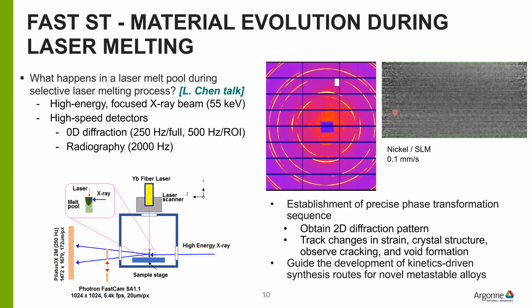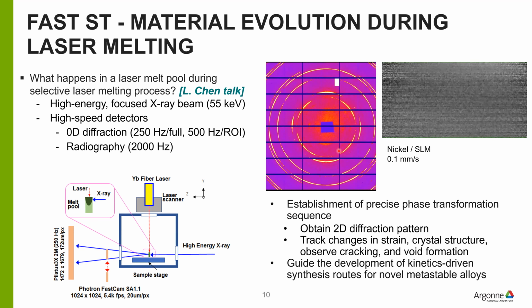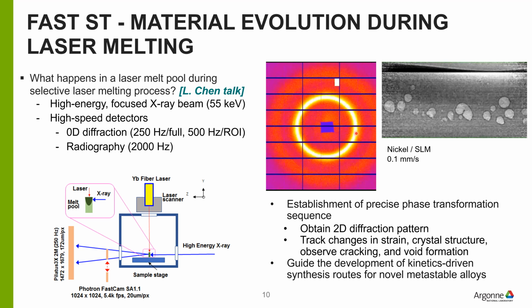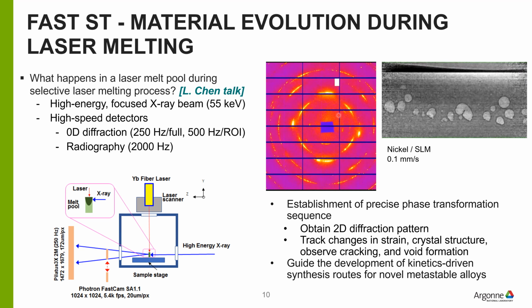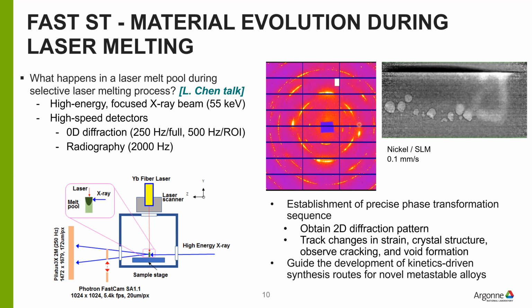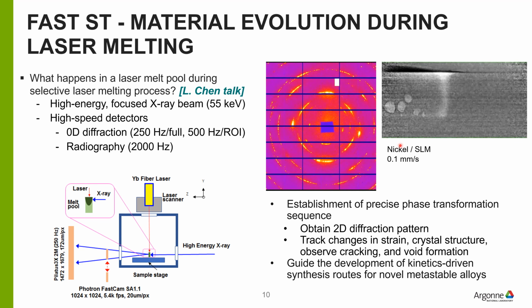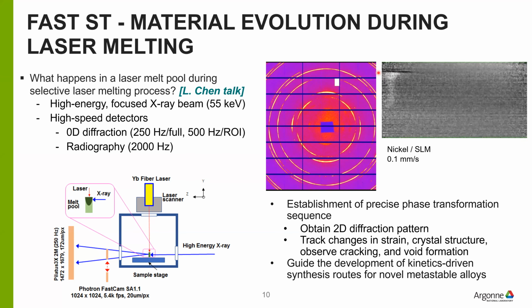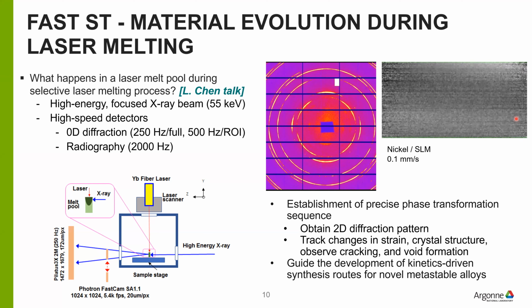Oh, now it works. All right, so the two videos work now, and on the left here is the scattering information at a spot, and you can see that the material goes from some amorphous phase in the liquid phase to some solidification with various diffraction peaks forming. And that's a piece of information you can get. And on the right here is a radiograph showing a field of view looking at the powder bed as a laser is going across. And you can see the laser going through and creating various structures that are very interesting as things solidify.